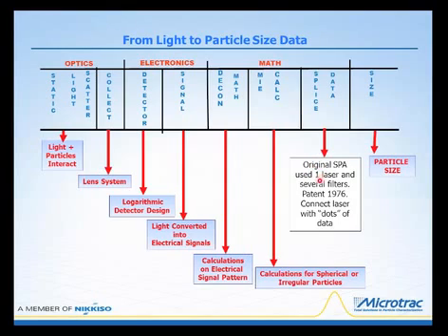It used one laser and several different bandpass filters, and we have patents dating back to 1976. Those patents ran out in the late 80s, early 90s, but we had already embarked on a new concept of trying to get away from using different filters and matching entirely different optical concepts. There could be some real issues with changes in those filters, which forced us to find new concepts in light scattering. But by the time we get done with all the mathematics, out pops the particle size report.